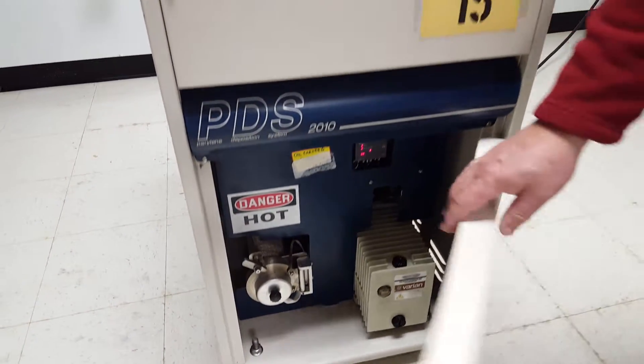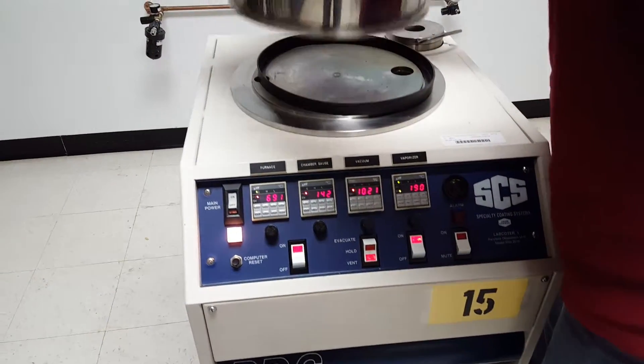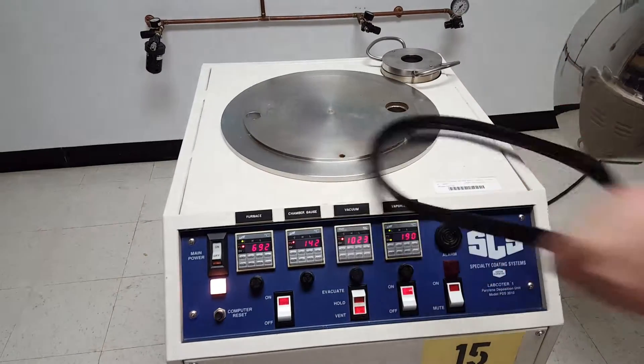If you come back up top, I'll show you the chamber. Here's the chamber.